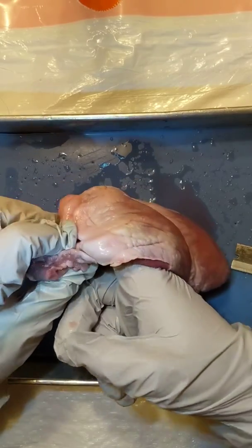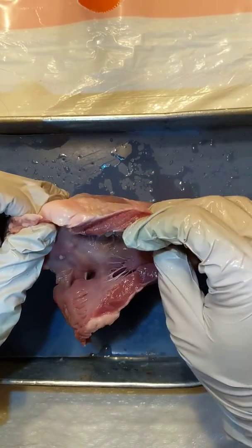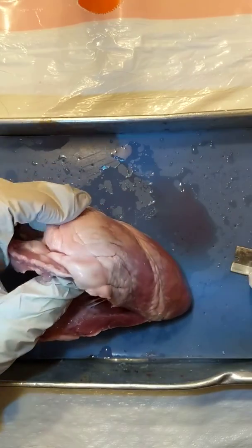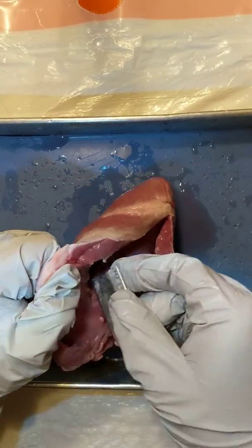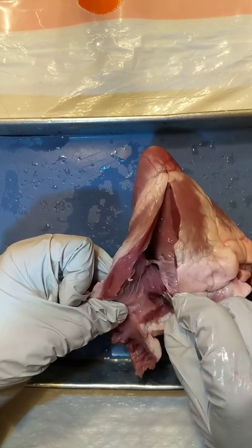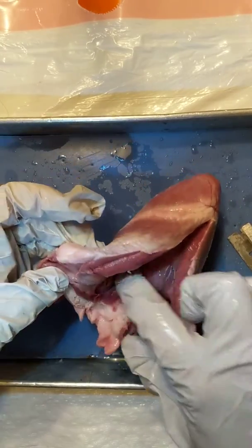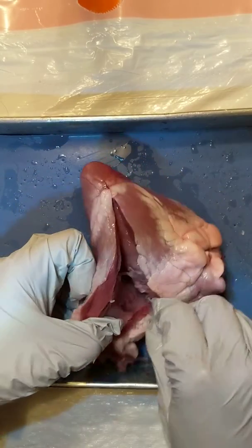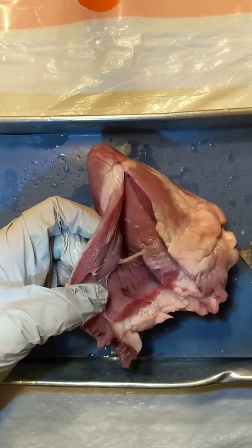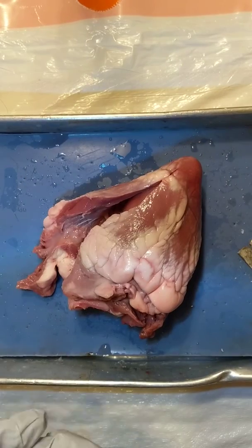There is a second valve up here — a pulmonary valve — that is sometimes harder to find. So there's the tricuspid, and the pulmonary valve is up in the pulmonary trunk. You can cut through your pulmonary trunk to attempt to find it. I'm not seeing the pulmonary valve — perhaps that part of the heart was cut off, or maybe I'm just not seeing it. That is the right side of the heart.